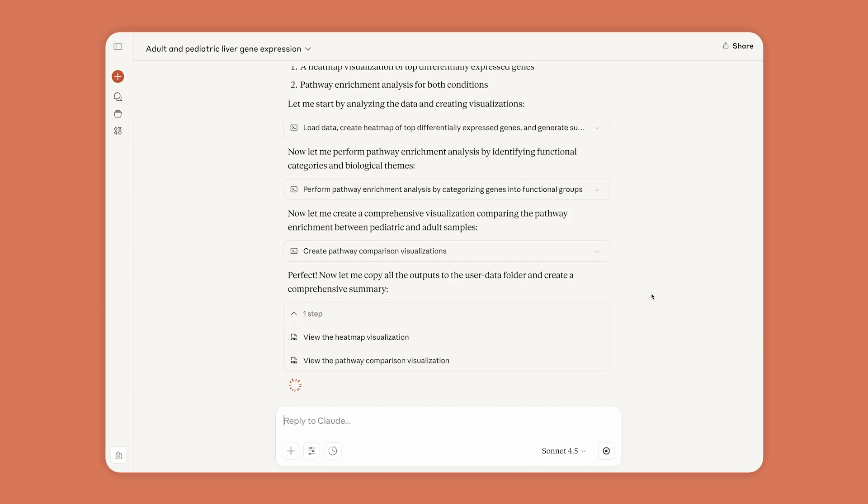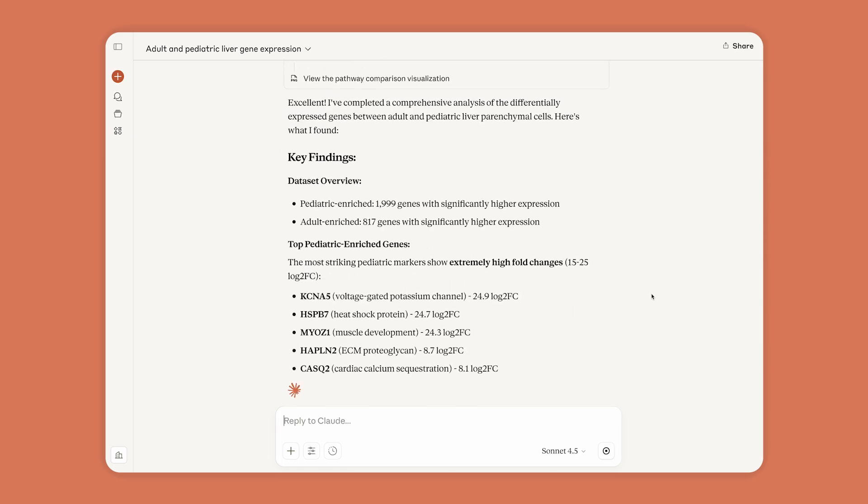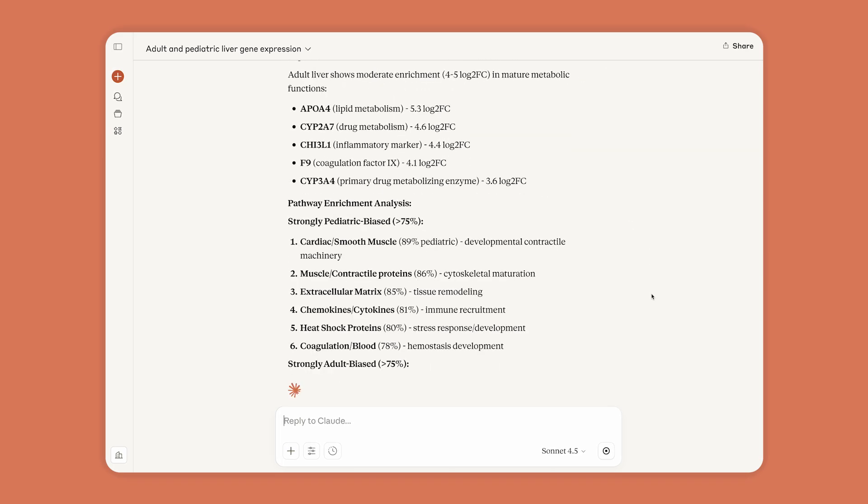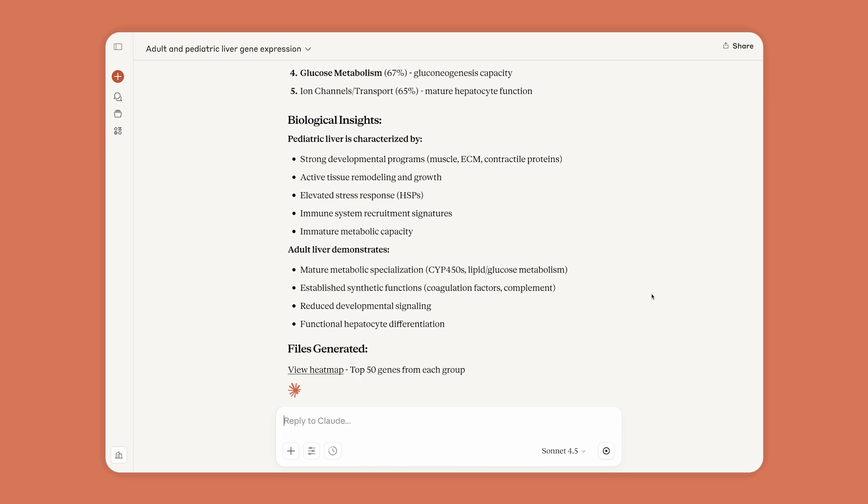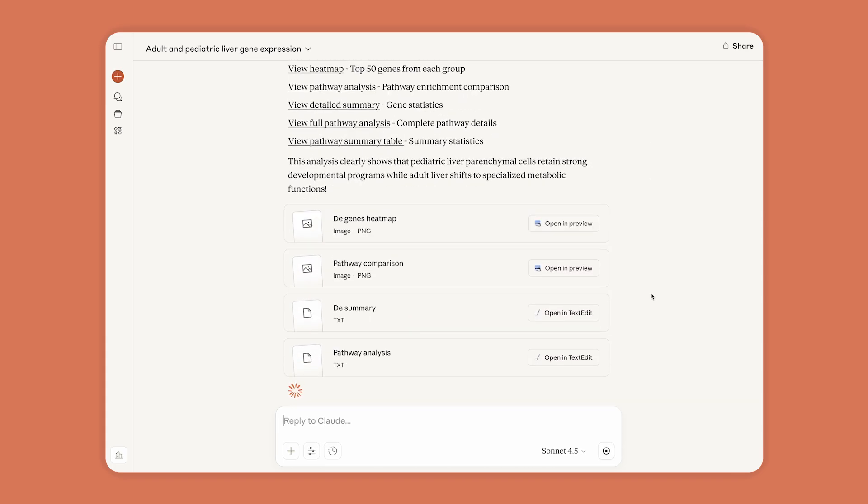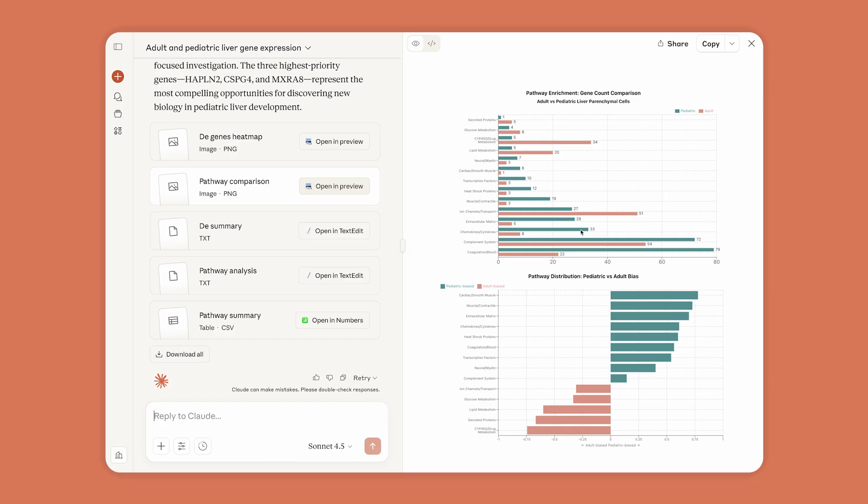Claude is a powerful research assistant, exploring patterns in the data using common bioinformatics methods. Claude produces visualizations to understand the trends, and it shows its work, so Anne can easily review and reproduce its analysis.